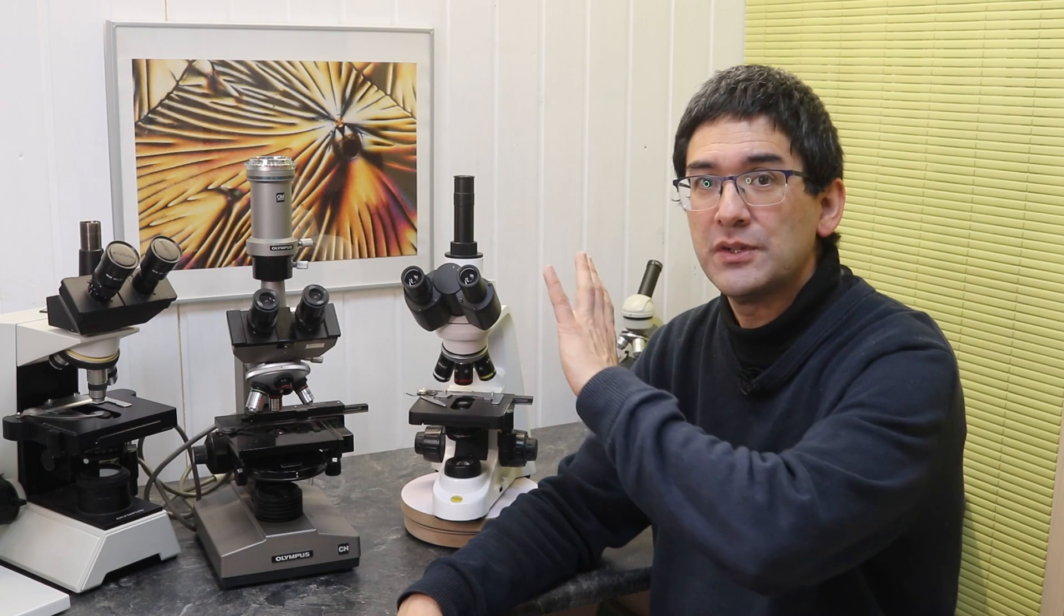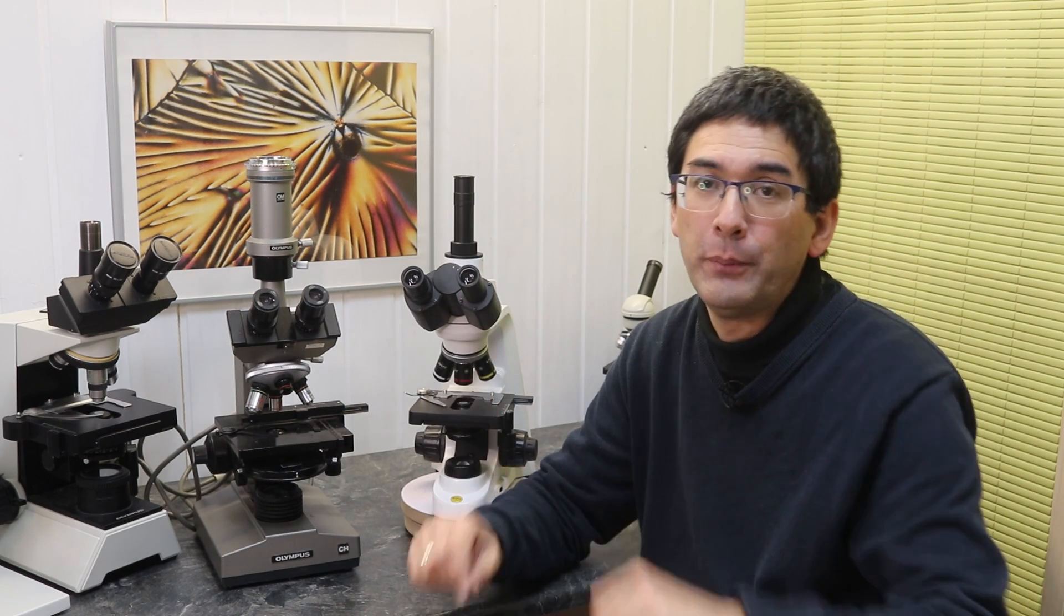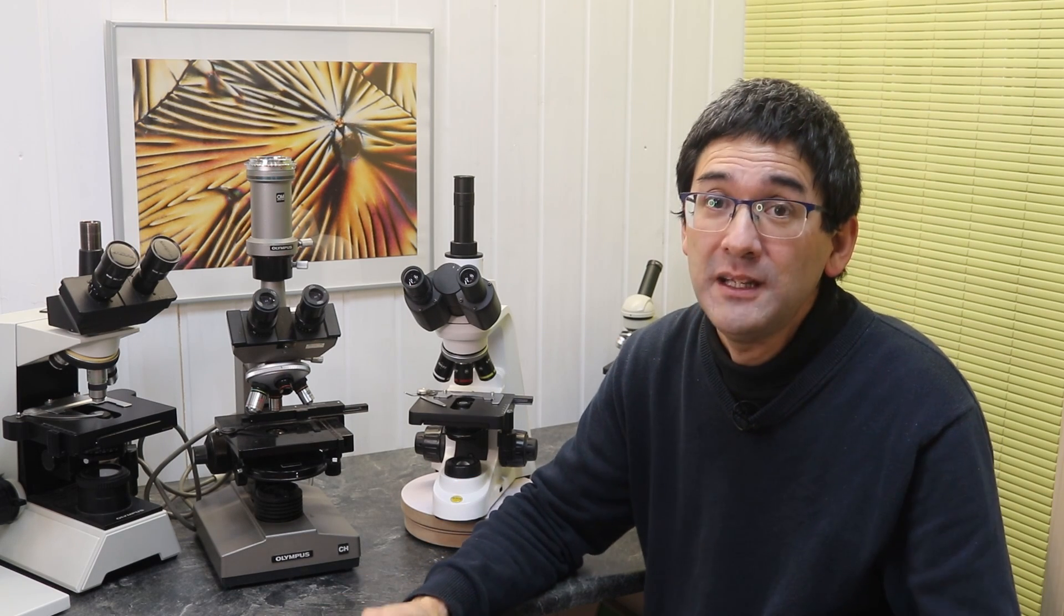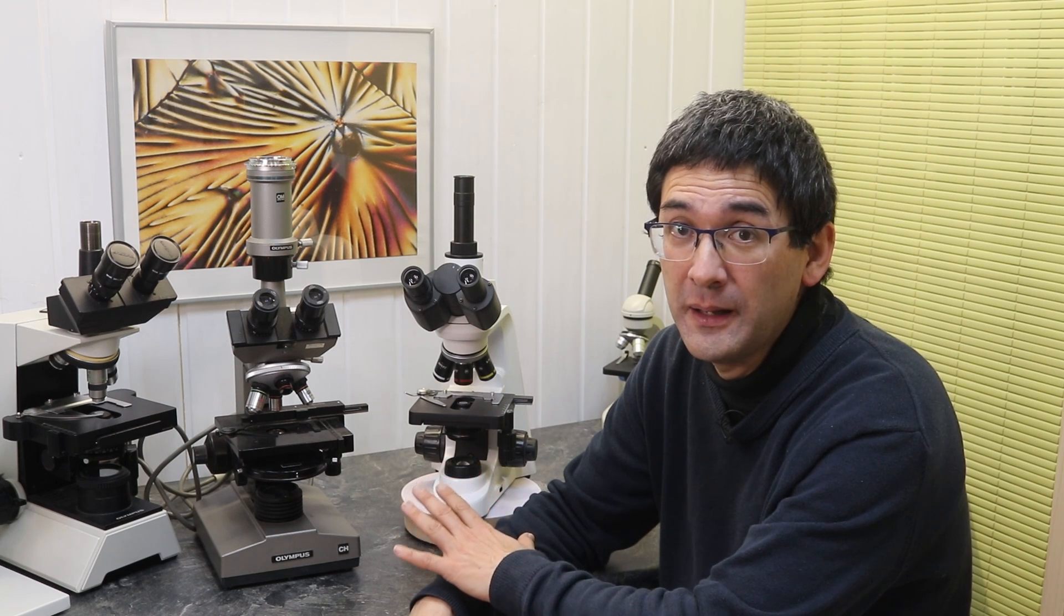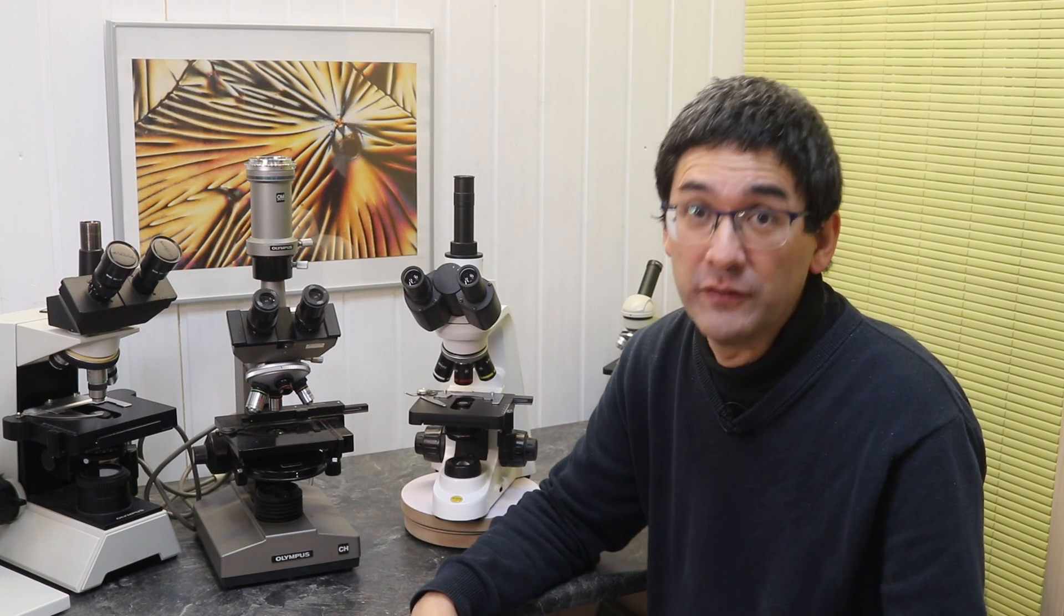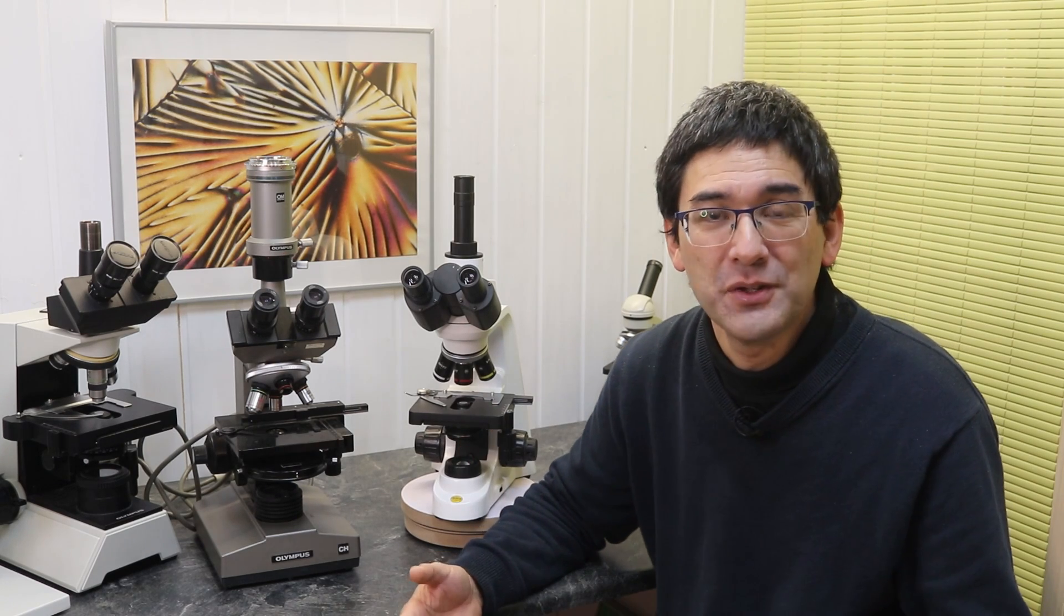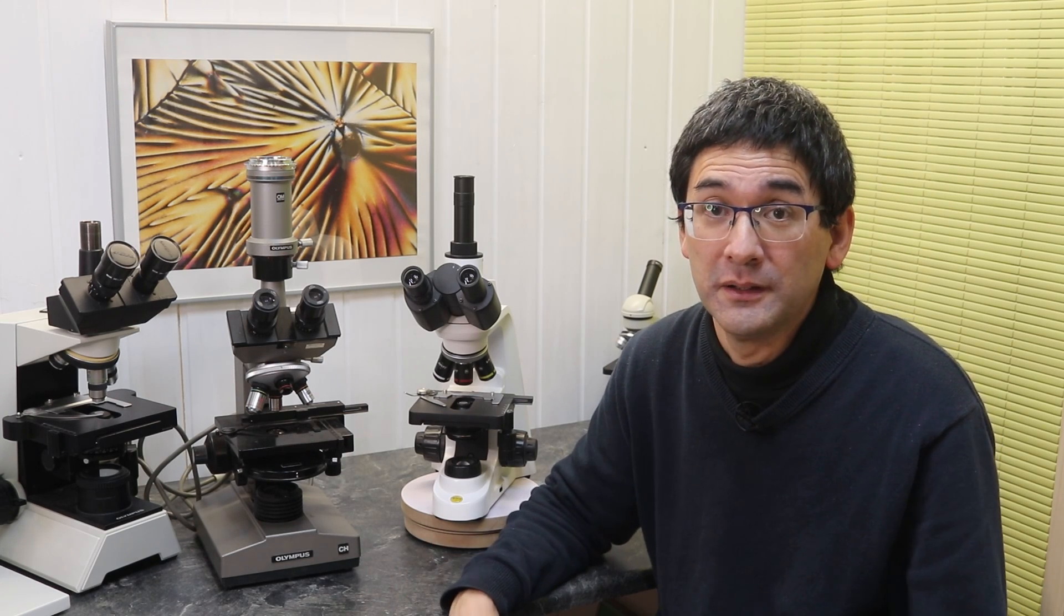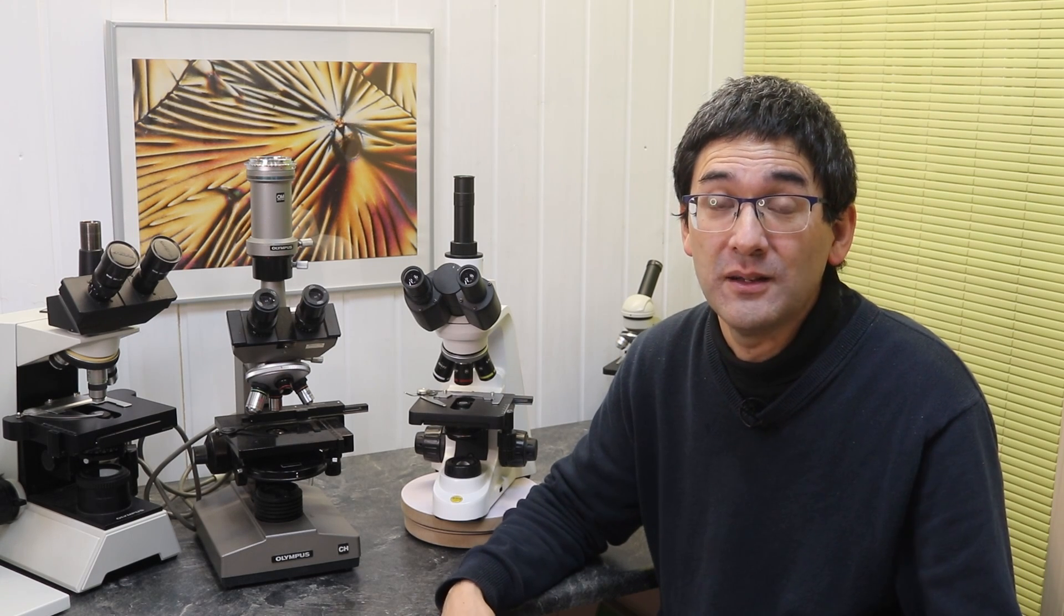These days however, in the last 10 years or so, more and more microscope brands came up offering affordable new microscopes. Those new microscopes are generally made in China. That in itself is not an issue, but there is one fundamental difference. If you buy yourself a new microscope out of the box, the main issue is not that the quality is not okay, but the whole issue of service. What happens if you want to get something repaired?